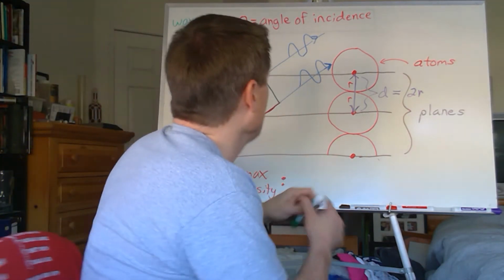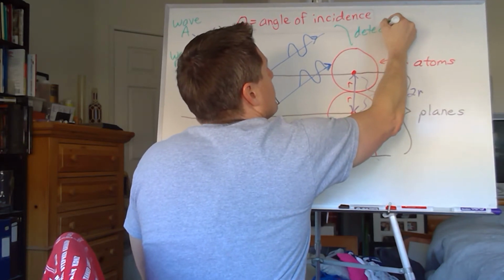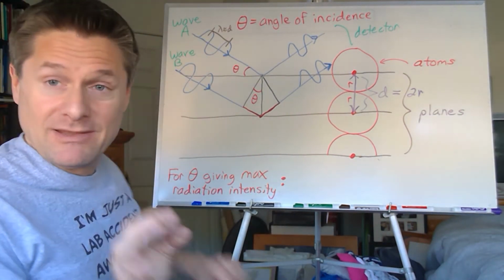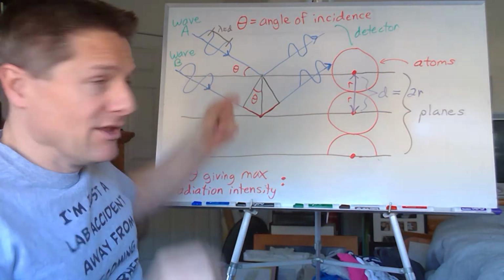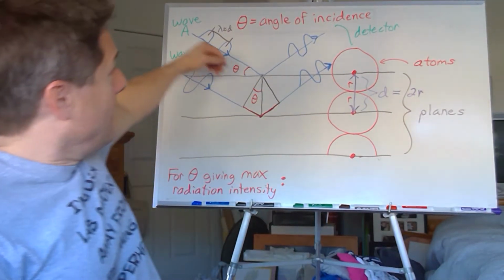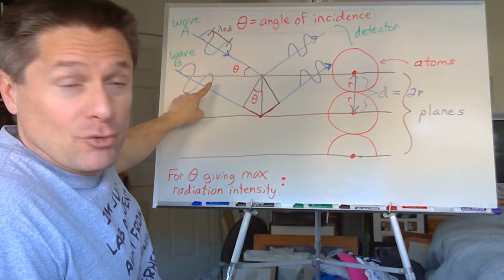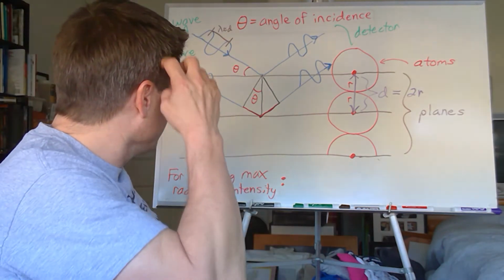And what we'll do is pull a detector over here. And that's where you get the X-ray diffraction pattern. And we're going to get the ones of maximum intensity. So it's pretty simple in the experiment, just change the angle, right? Pretty straightforward. And you can move it all around the crystal, get it from every which way. So in order to get the maximum intensity, these two waves must be integral multiples of their wavelength, right? Integral multiples of each other.